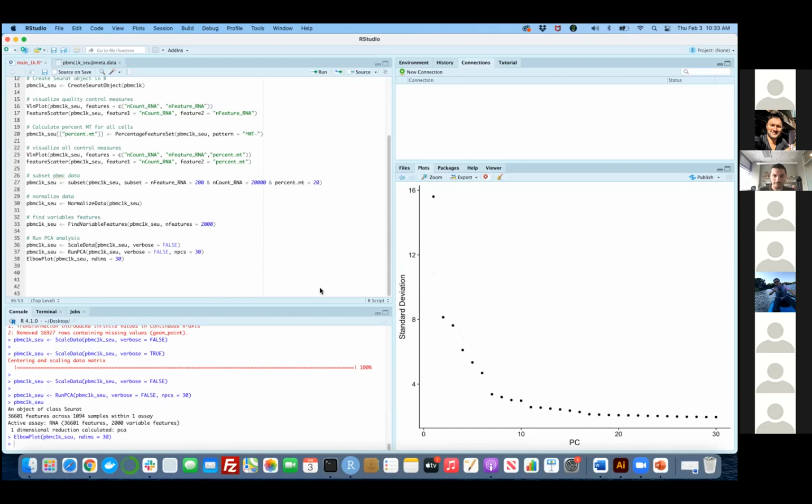your analysis. Basically, we are trying to pick the actual number of PCs that we want to move forward with for clustering later. The rule is that you are trying to find some kind of an elbow. That's why the plot is called an elbow plot, where you see that the more you add, you're not gaining anymore.